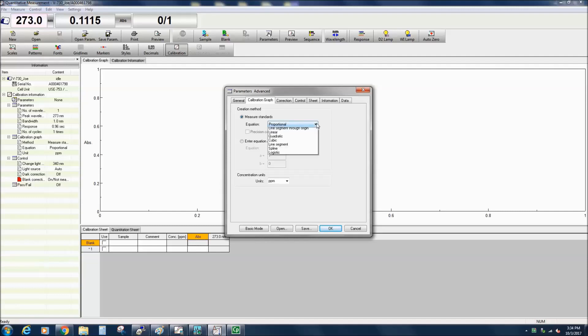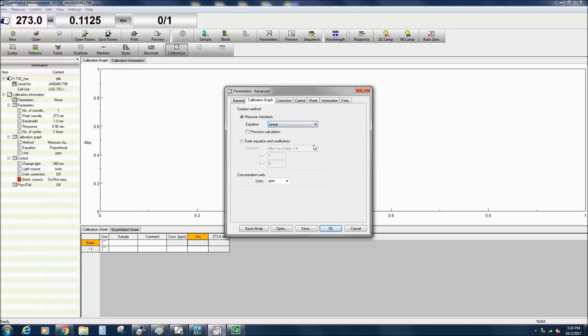There are ten equations available: Proportional, Linear, Quadratic, Cubic, Line Segment, Spline, and Logistic. The quadratic, cubic, and line segment methods can also be selected to pass through the origin.